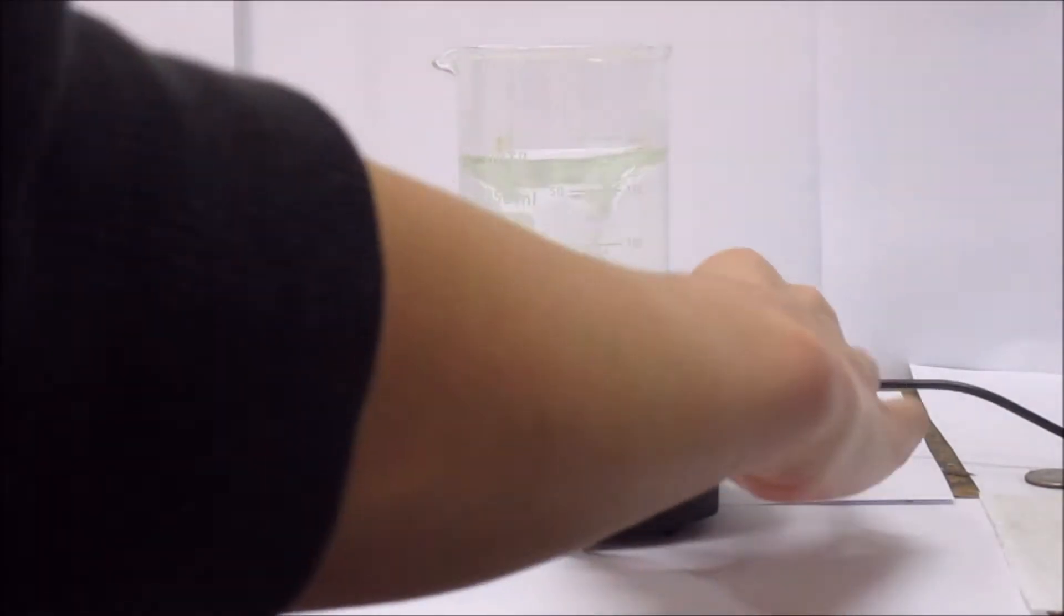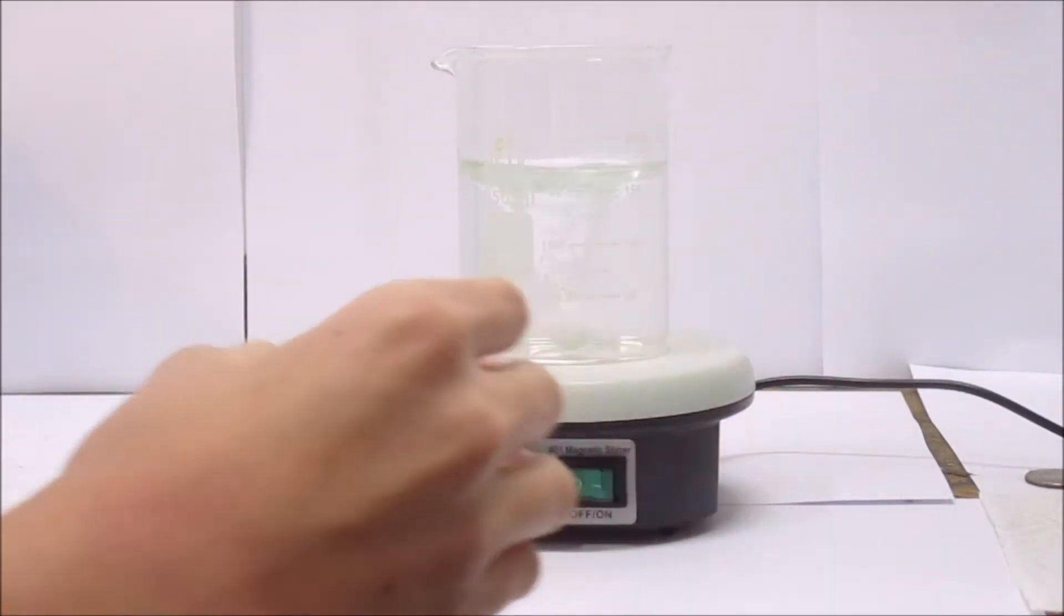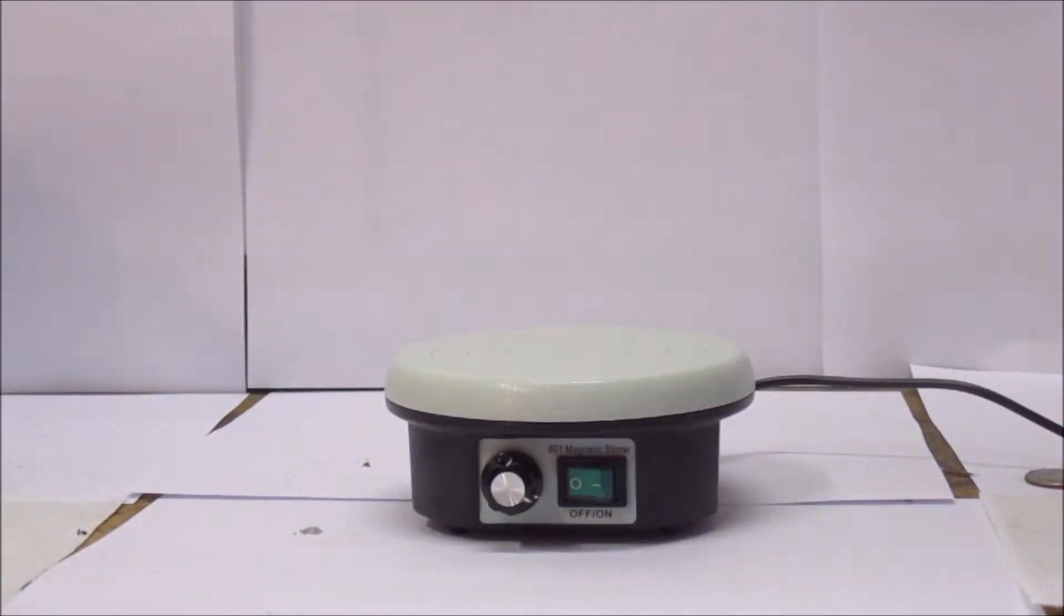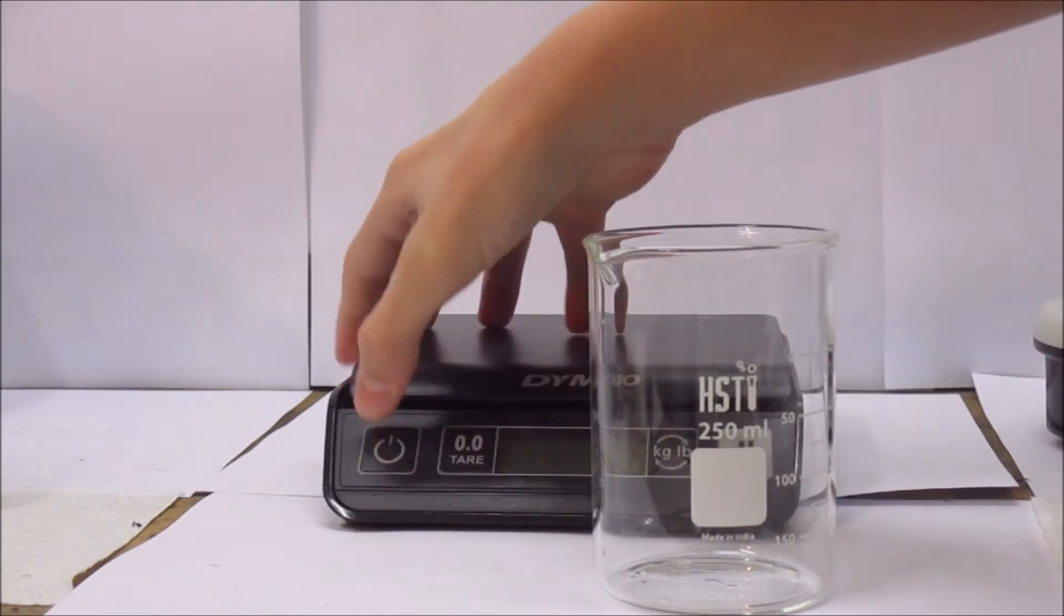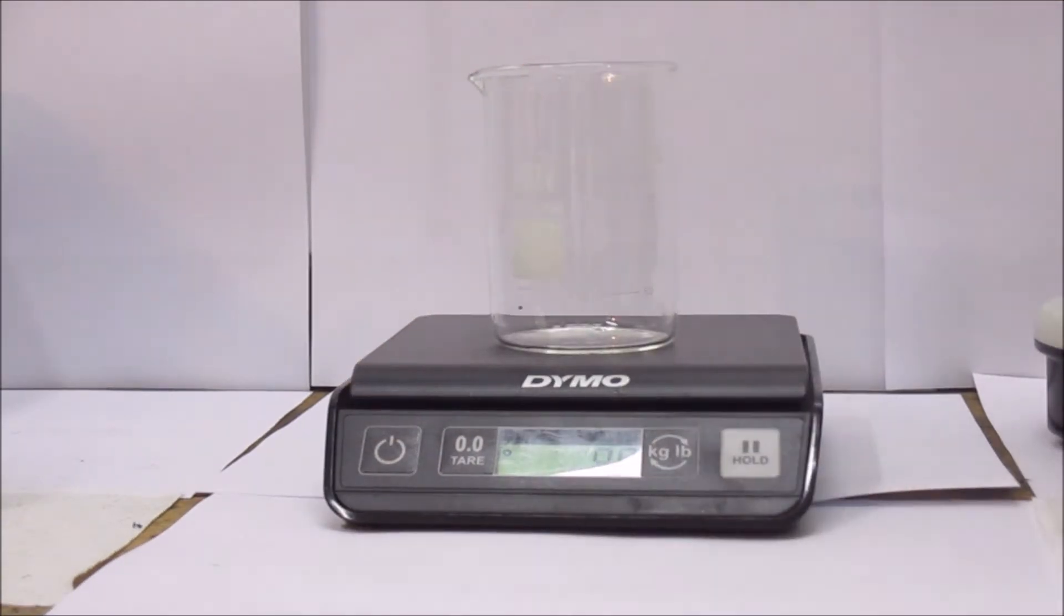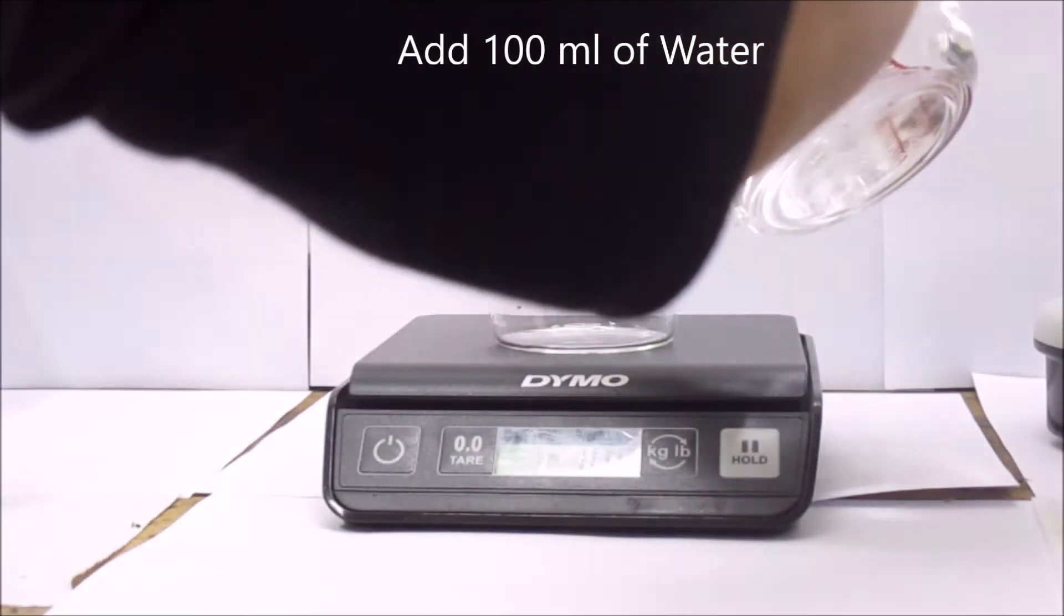When it was fully dissolved, I turned off the stirring and took it off the stir plate. Then I got a new beaker, placed it on the scale, and added 100 ml of water.